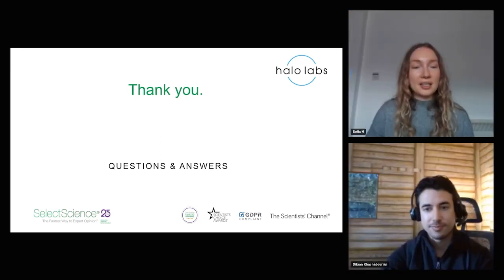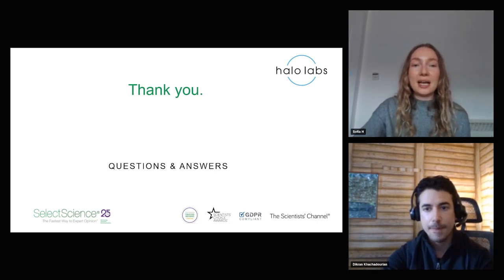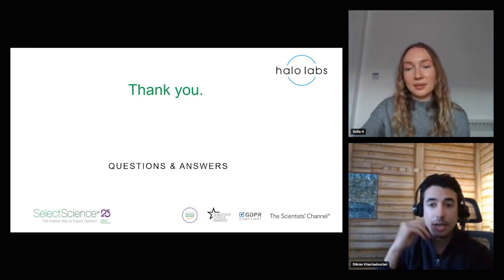Great. I think this is our final question, unless anyone wants to send any more in. You mentioned thioflavin T staining for protein IDs. Would it be possible to use an antibody labeling approach on the Aura PTx? Absolutely.